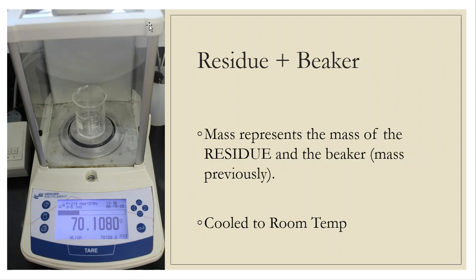And quite honestly, folks, whenever I use methylene chloride that evaporates off like this, I leave this beaker on there and I wait for like 5 minutes and I come back to see if my mass has changed any at all. If it has, then that means methylene chloride is still there and it's still evaporating off. And what I did not see was a fluctuation in the mass.